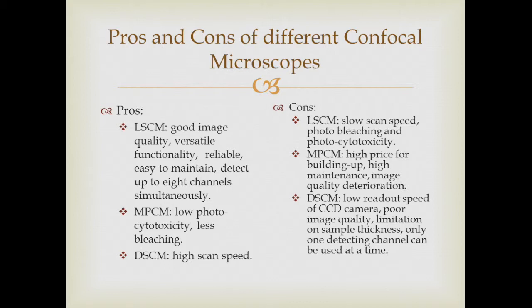Multiphoton microscopes are expensive and require extensive maintenance. The lack of a pinhole causes image deterioration. The disc scanning microscope has a low readout speed because of the CCD camera. We are also limited on the thickness of the sample that we can observe via the Nipkow system. It gives poor image quality, and despite being multi-channel, we can only use one detecting channel at a time.